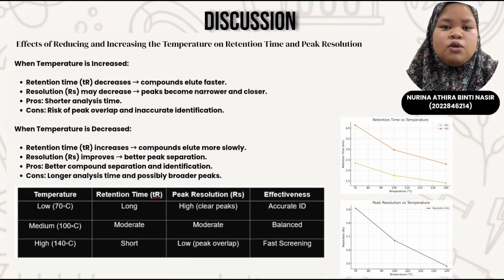In summary, if we want high-quality separation and accurate identification, a lower temperature is more suitable. But if we need faster results and are willing to compromise slightly on resolution, a higher temperature can be used.